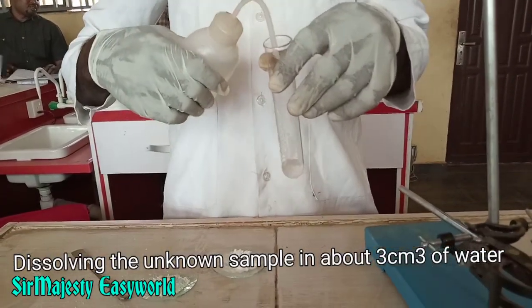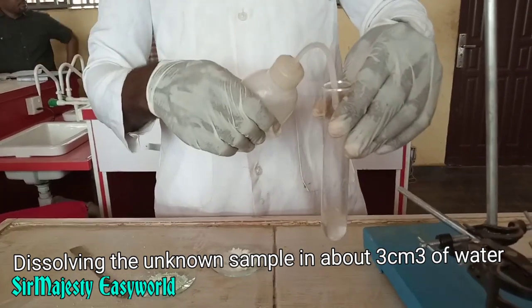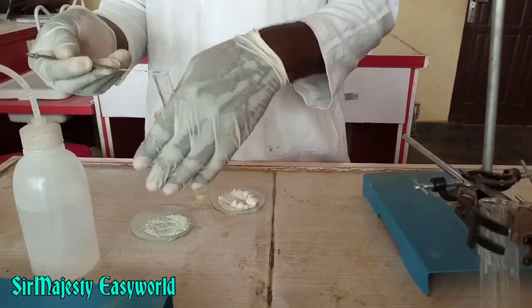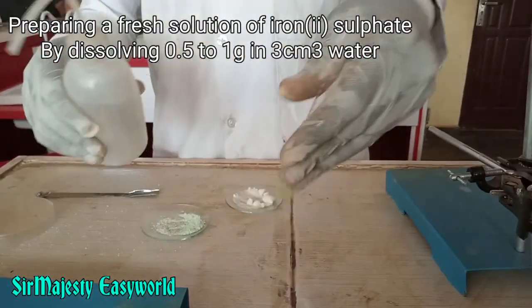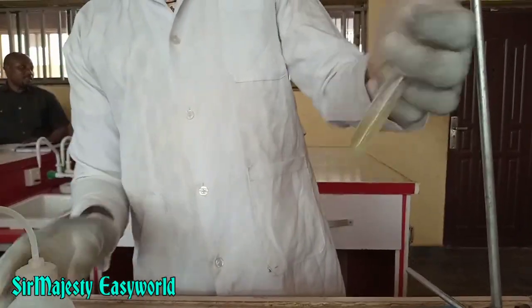Dissolve about one gram of the unknown sample in about 3 cm³ of distilled water. Then prepare a fresh solution of iron(II) sulfate by dissolving about one gram of the sulfate in 3 cm³ of distilled water.